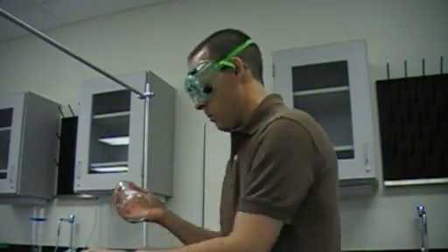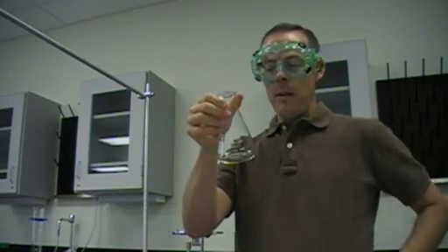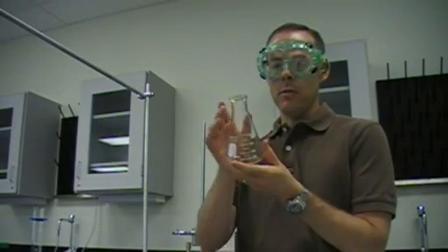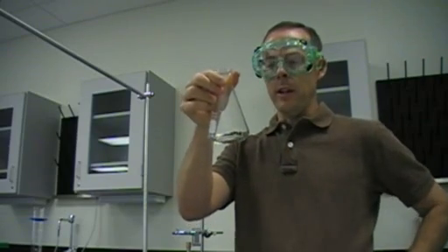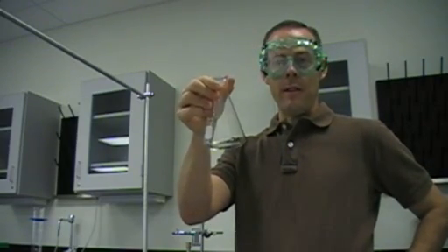Another great way to get an approximate amount would be a flask. Due to their shape, these are quite a bit more expensive, so we won't use these as often. But again, these markings, each line represents 25 milliliters, so it's an approximate way, not very exact.